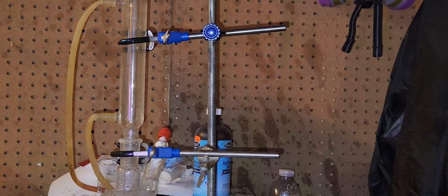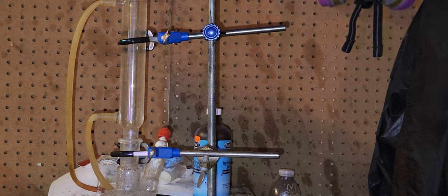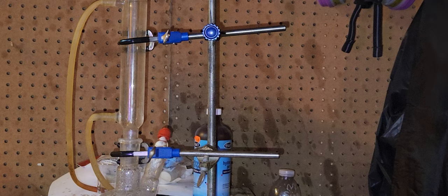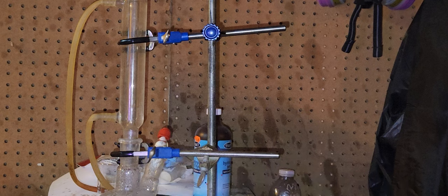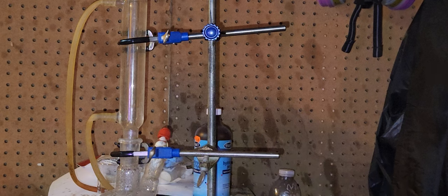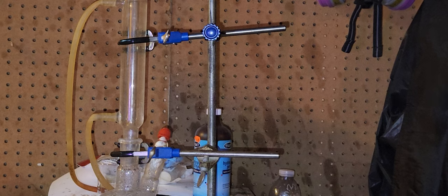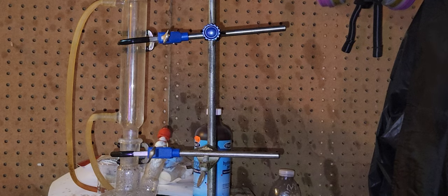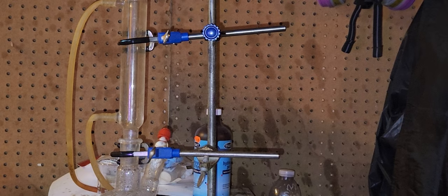I'll be using this with spore-forming bacteria like Bacillus lentomorphous, which is a natural insecticide. I'm going to use it to test resistance. Last time I did this, the bacteria absorbed 60% of the lead salt, so I want to try again with better methods using a bioreactor to produce higher concentrations.